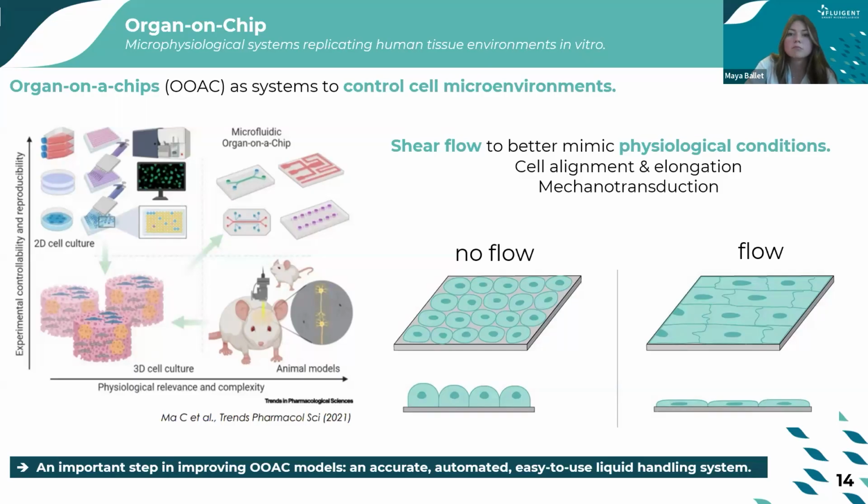So in conclusion, long-term organ-on-chip cultures rely on this stability, and this is why the choice of the pressure controller is very important for this kind of experiments.